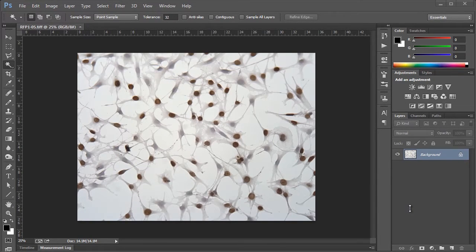Got a really cool lesson for you today, which I think you'll be quite surprised what we're capable of here inside Photoshop. But first, there's a couple of things to note. The first is that this is an advanced lesson, so I might be glossing over a few things or speeding through some things. And if I'm going too quickly in some places, I'm sorry about that. But hopefully you can look back in some of my earlier videos once I get around to making them, where I should explain everything we need to know to get through this video.